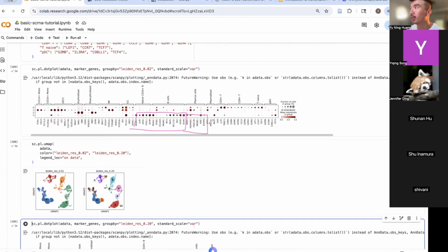They also show their gene signature. Cluster 0 are T cells, but we can't really subset the cells. And cluster 1 shows multiple gene signatures, like CD14 positive monocytes, dendritic cells, or even natural killer cells and ILCs. So if we set the resolution too low, we won't be able to identify subclusters.